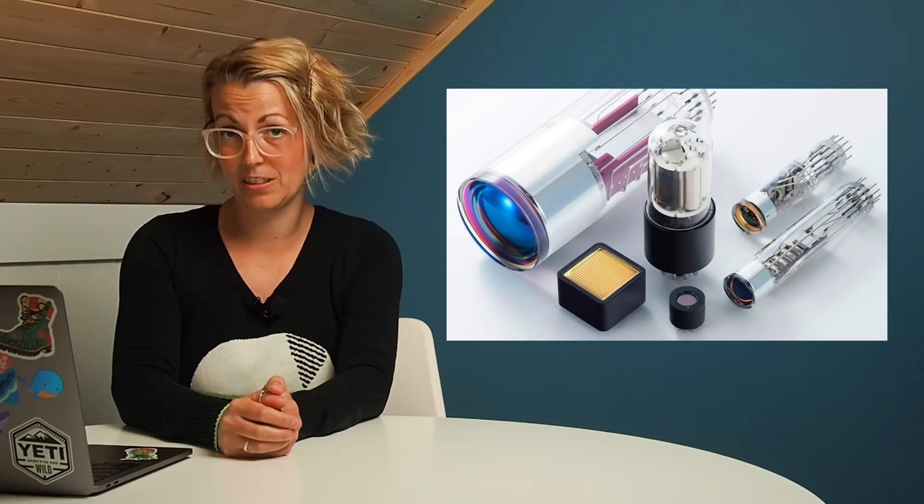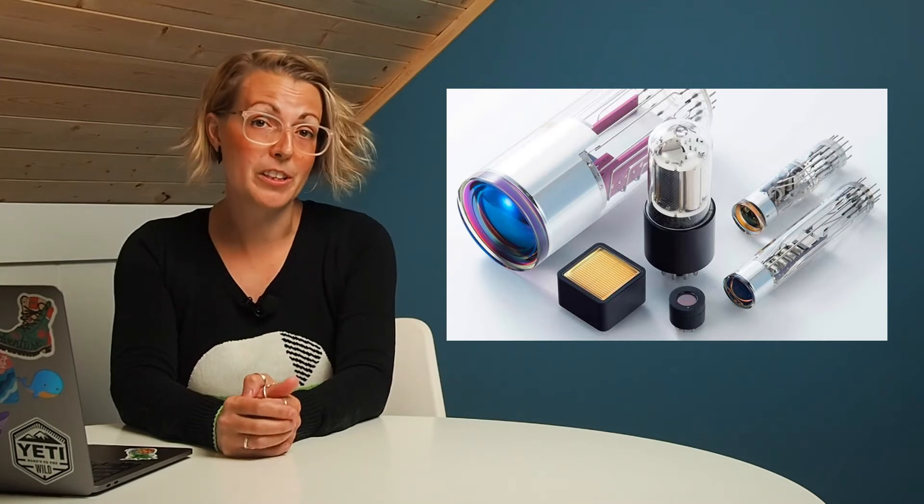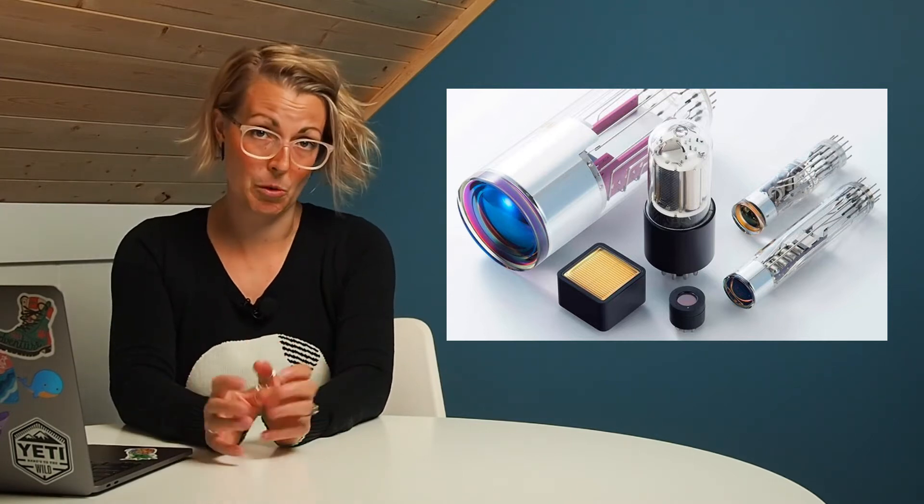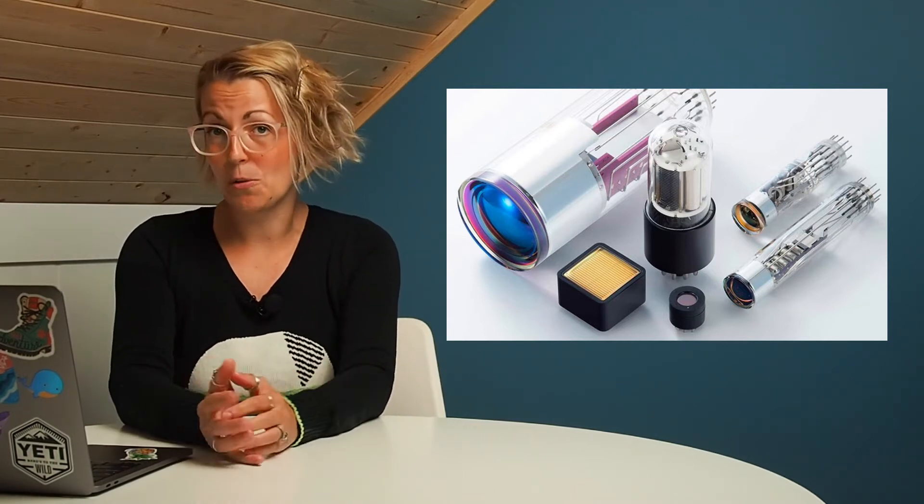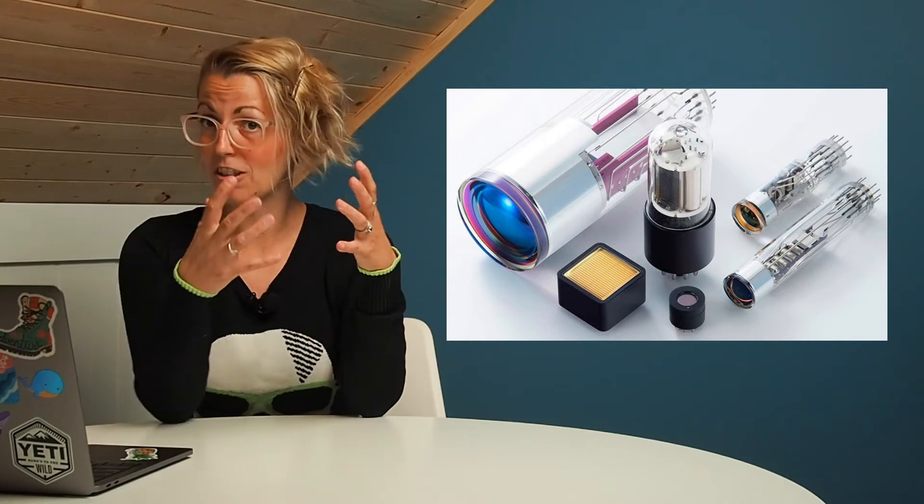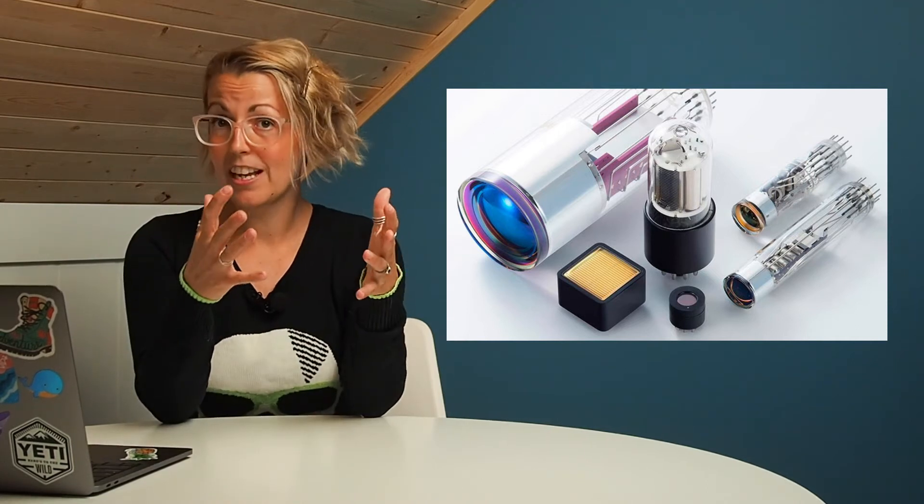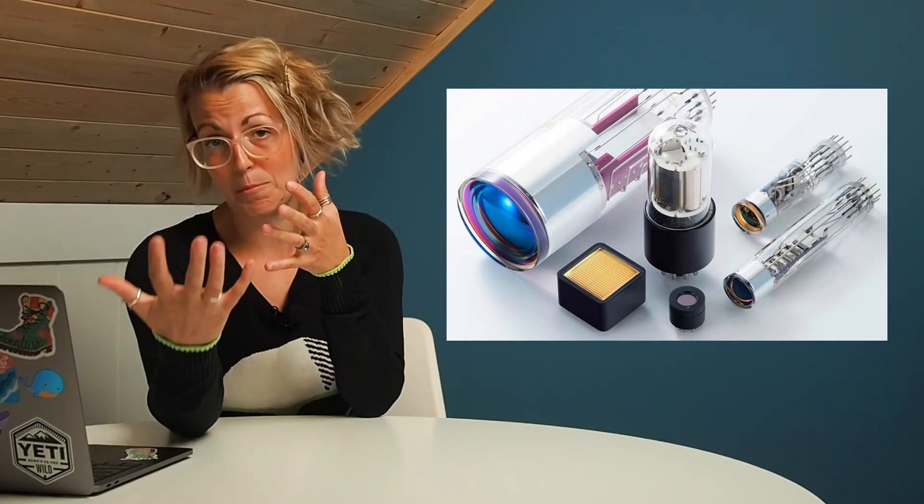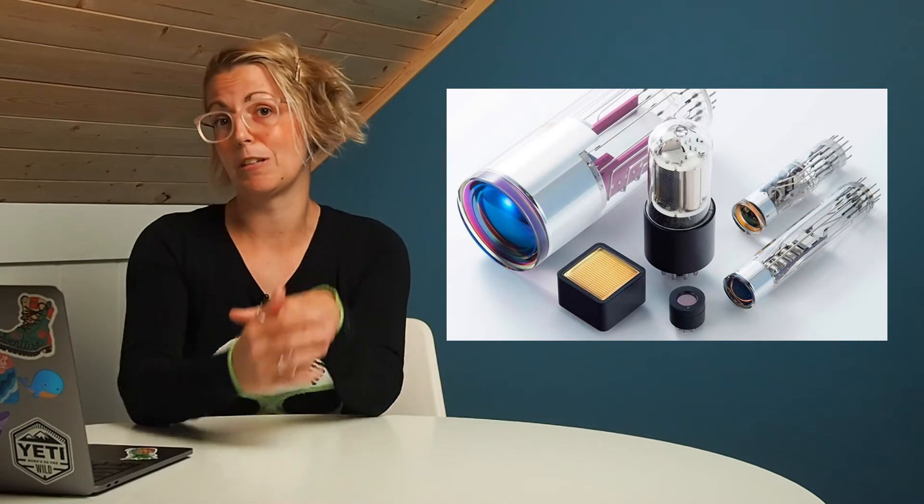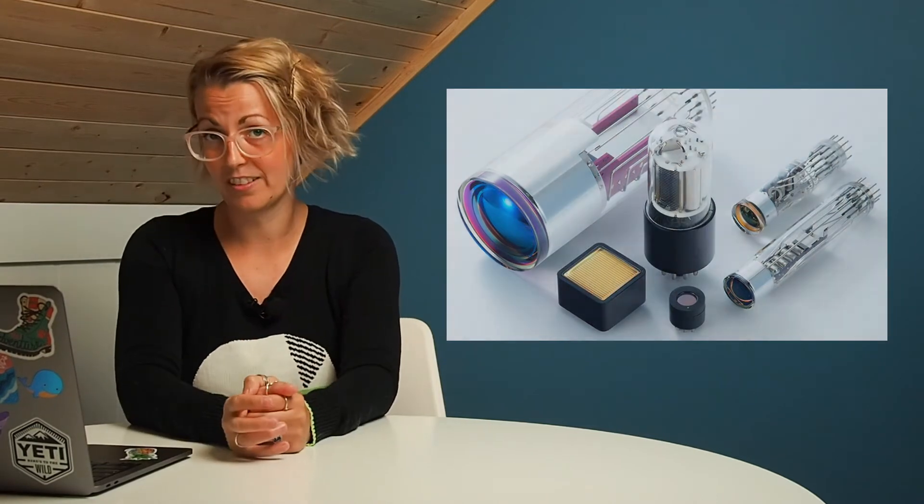In a standard flow cytometry system, the detection is usually done by photomultiplier tubes or photodiodes. We're not going to go into the exact physics of how these work today. All I want you to know is that these take your light signals, the photons, and convert them into an electronic signal that the computer can read.